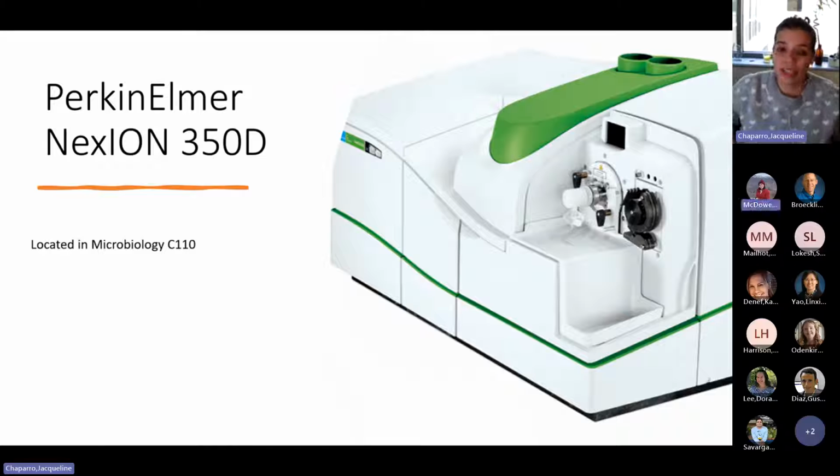So the ICP-MS that we have here at Colorado State University is the PerkinElmer NexION 350D, and it's located in the microbiology room C110. When you're measuring ICP-MS, this is a relative measurement method where we need to essentially calibrate the system prior to analyzing unknowns in order to determine the concentration of the element in the sample. And so let's peek underneath the hood, so to speak, to see what all the components in the instrument are.